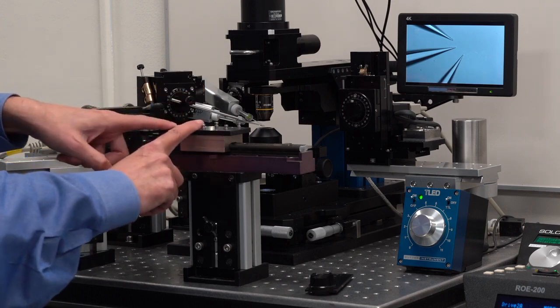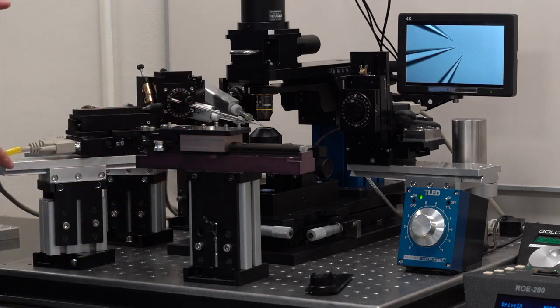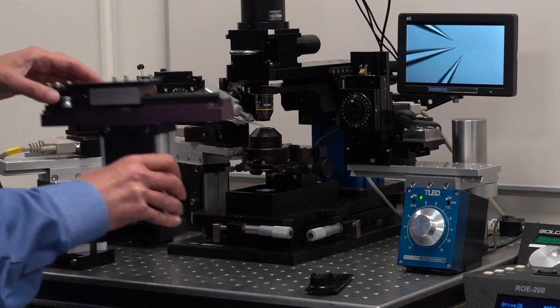The problem with this setup is it is more expensive than the normal stand.